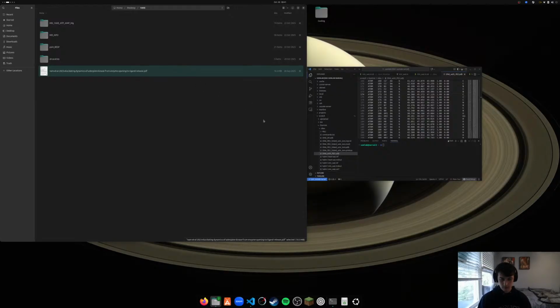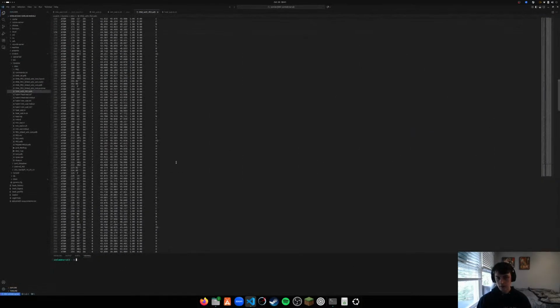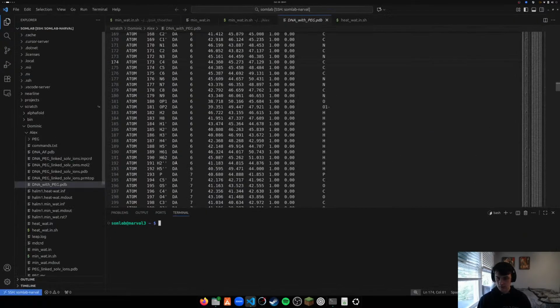Now it works. It's just weird stuff like that. Drives me up a wall.